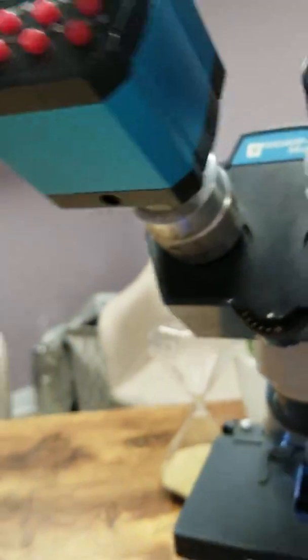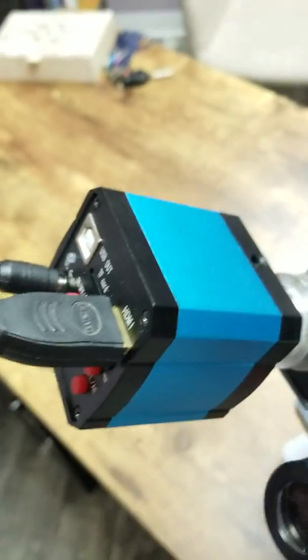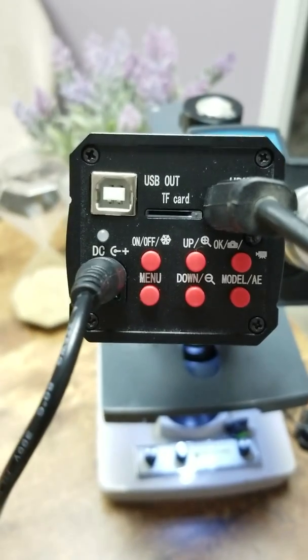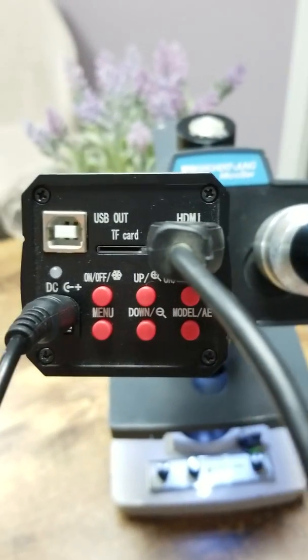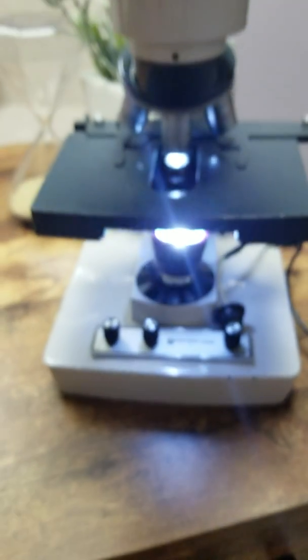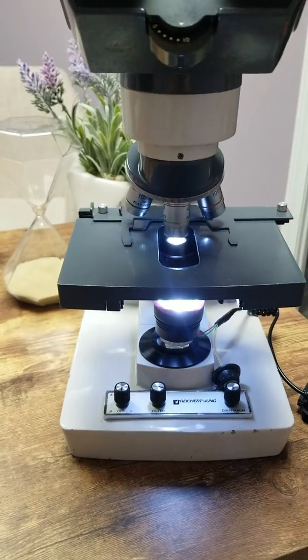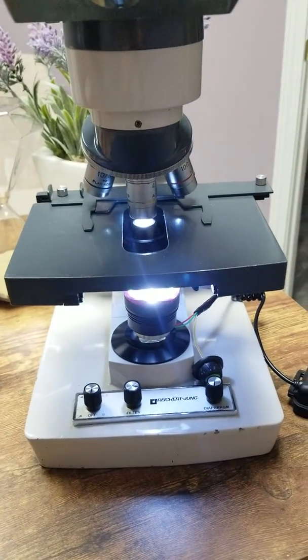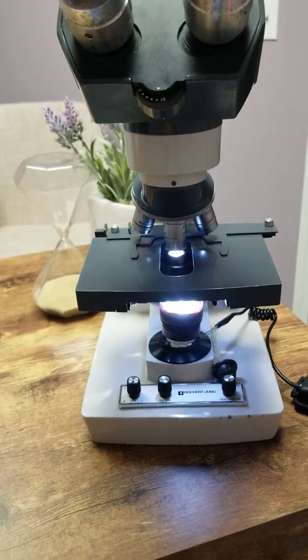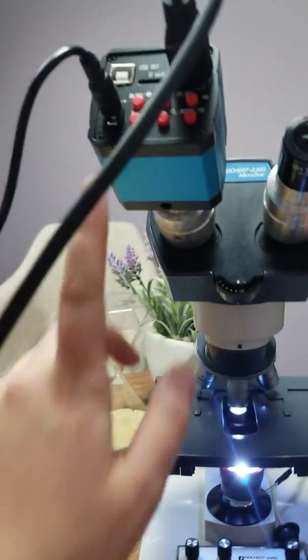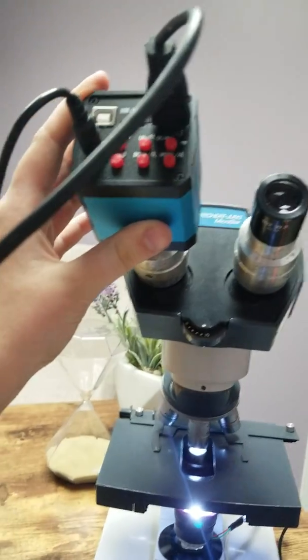And then this camera is the best camera ever. I actually don't know what it's called, but I'll figure it out. I got it on Amazon. It was only like $150, I think. Whereas I had spent $300 on another camera from a microscope company, and it was horrible. So I sent that back and got this camera for $150.